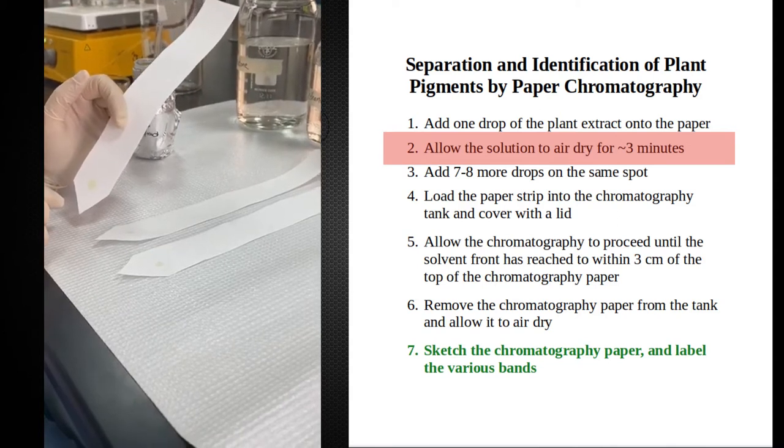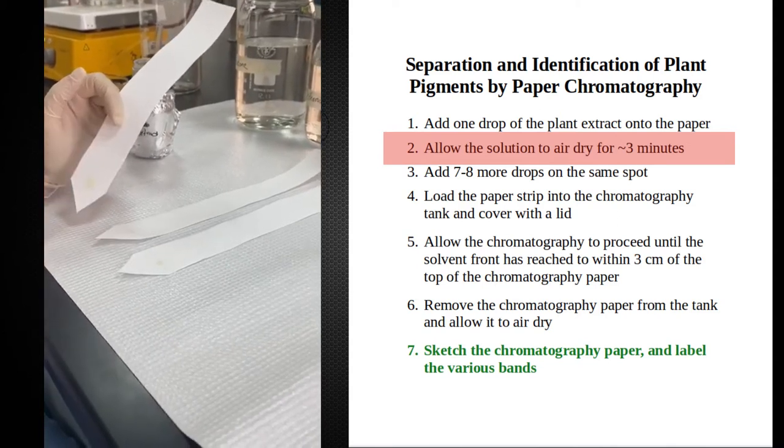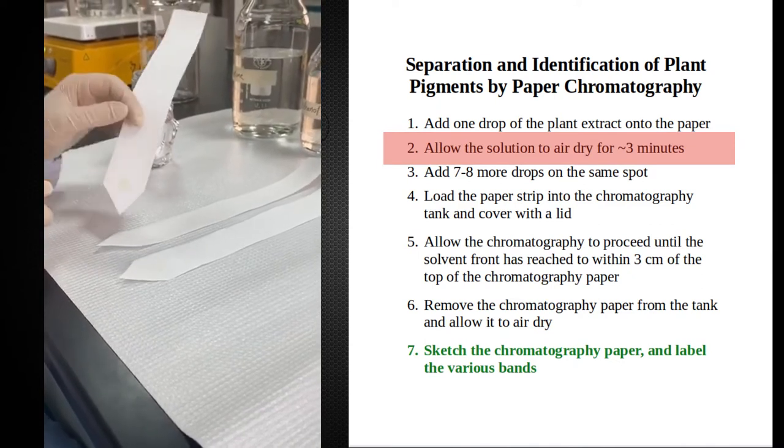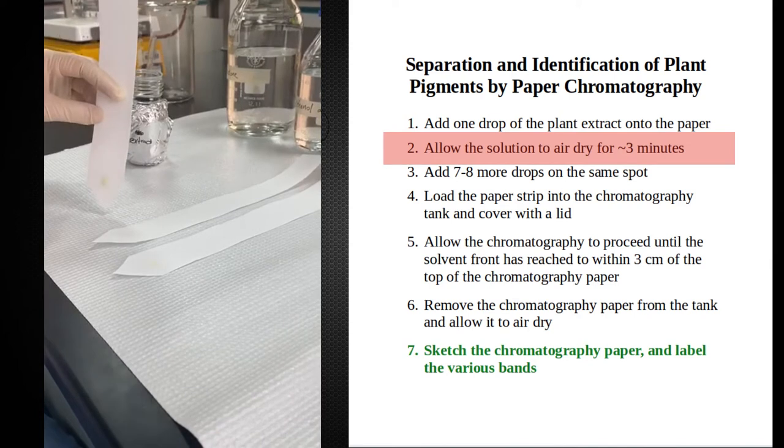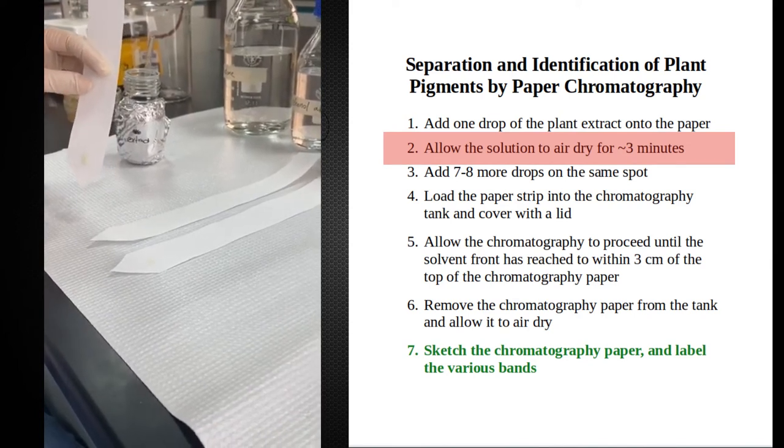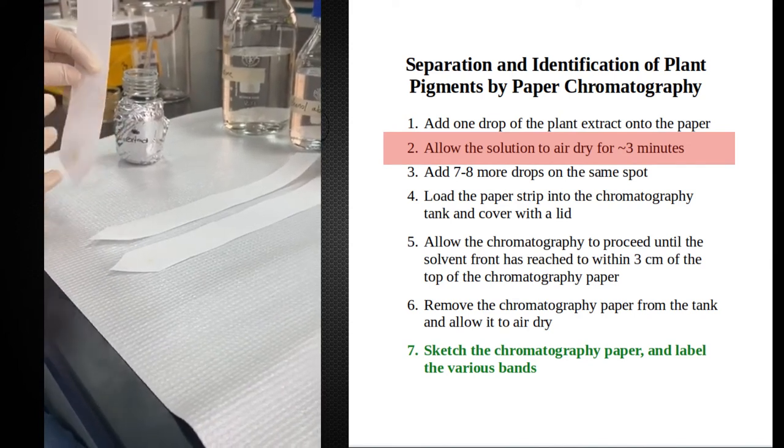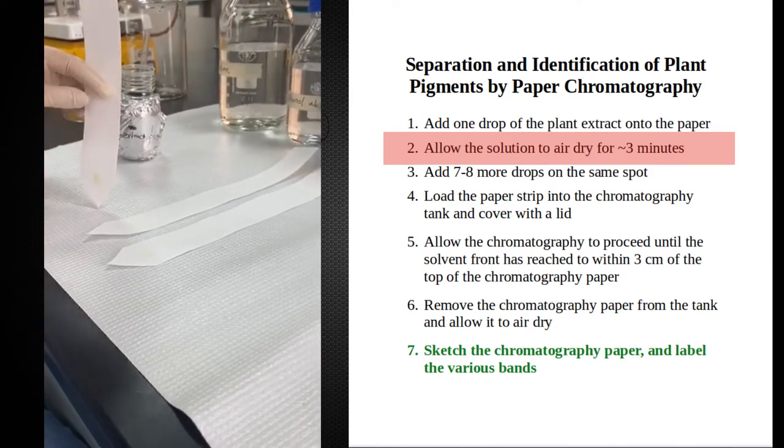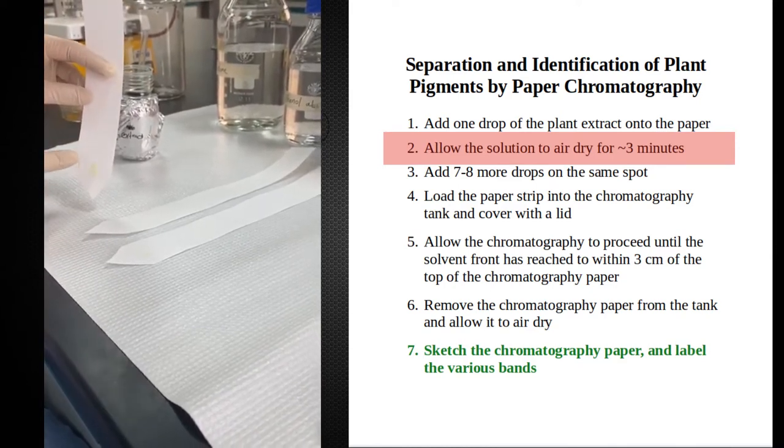This is cellulose filter paper. This paper is polar. When I'm done depositing these dots of chlorophyll, I'm going to dip this paper into a non-polar solvent. The paper is polar, the solvent is non-polar. The solvent is going to be sucked up in the paper.